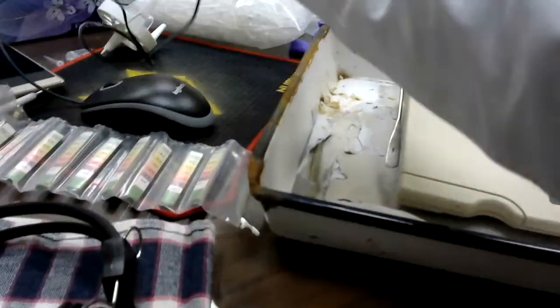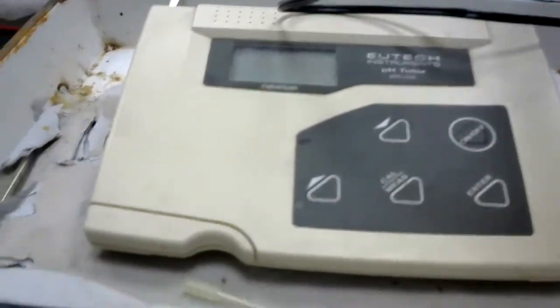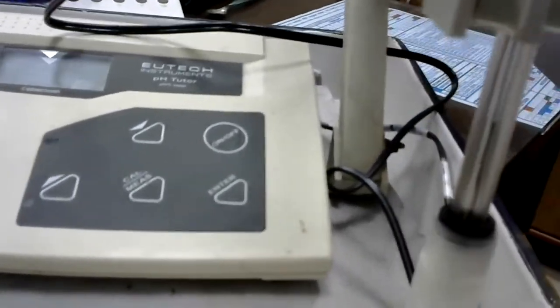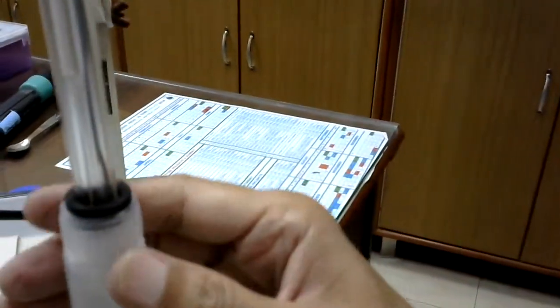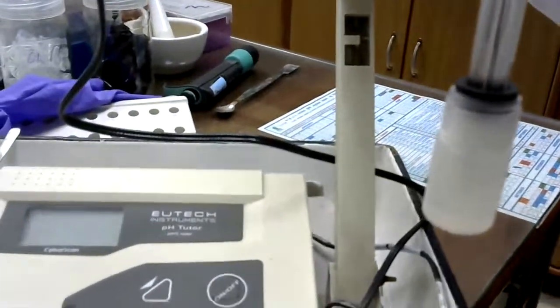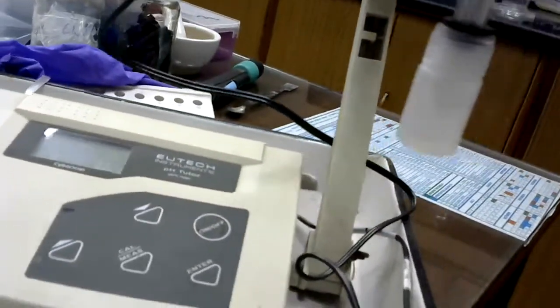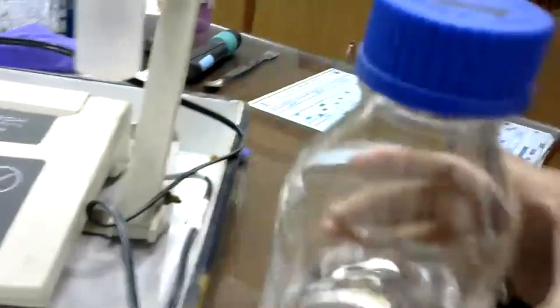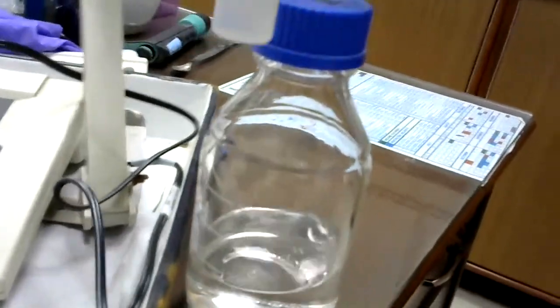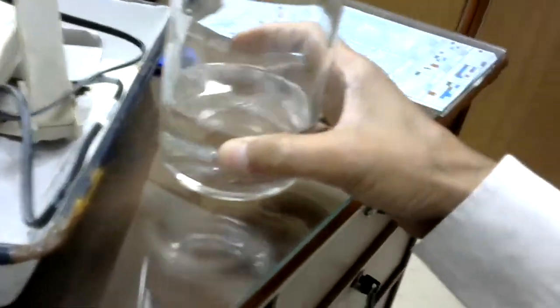This works on electricity. Okay, and this is the main instrument, and this is the electrode of it. Okay, so you have to put this electrode into the solution, like this. So this electrode should go inside here, inside the solution.